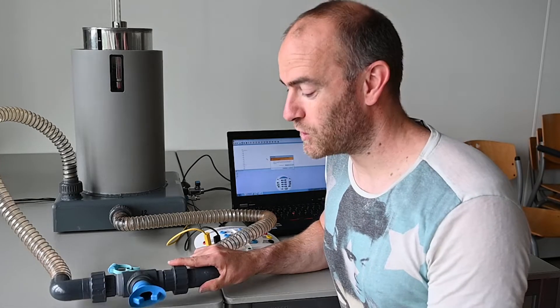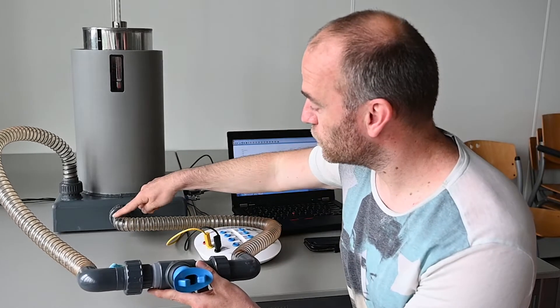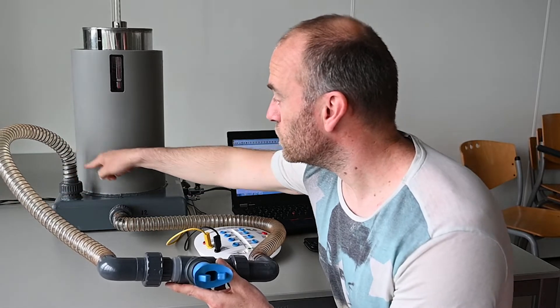The water clock respirator consists of several items. One of those is the nozzle through which you breathe, and it's connected via a tubing system to the water clock itself, which is filled with water.